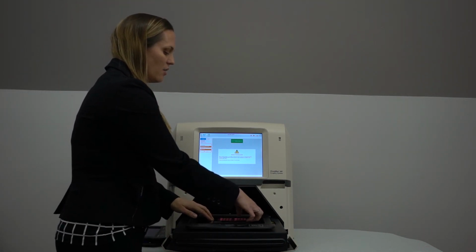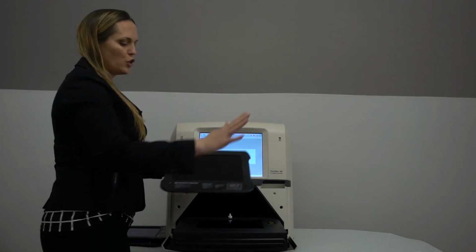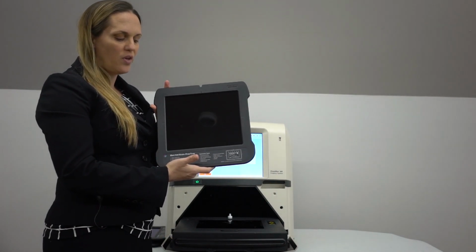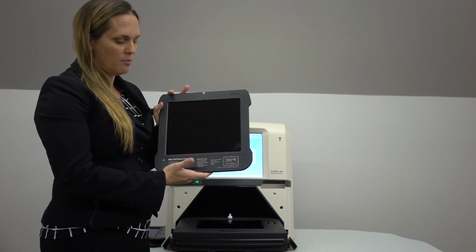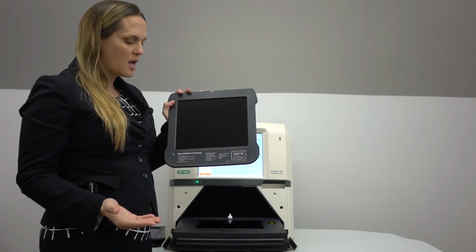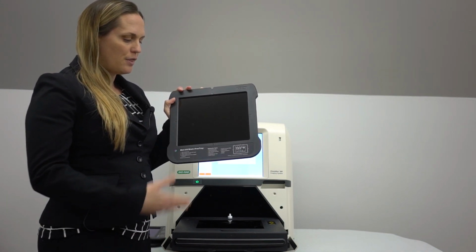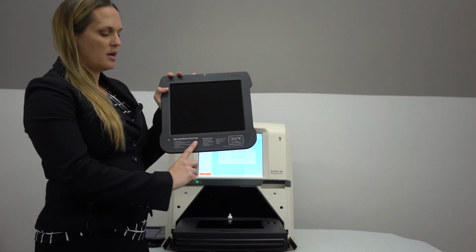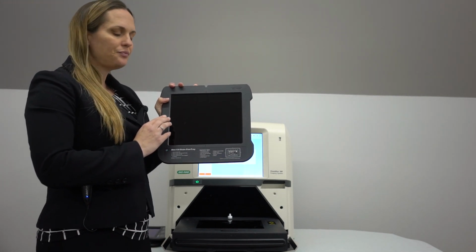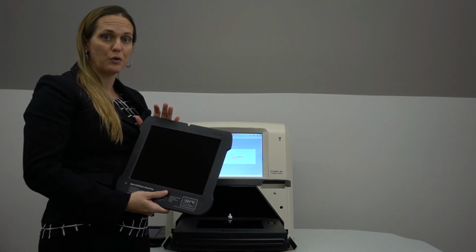Depending on your application, you'll be choosing a different tray to go on top of the pull-out tray. So this is our stain-free UV tray that comes with the ChemiDocMP, and this is for most of the applications that you'll be doing: fluorescence blots, chemiluminescence, your stain-free gels and blots, and ethidium bromide. It tells you right on here the application types that you'll be using for each tray. And as you'll see later, the system won't let you choose the wrong tray for your application.